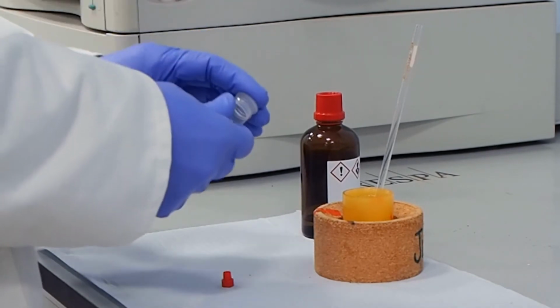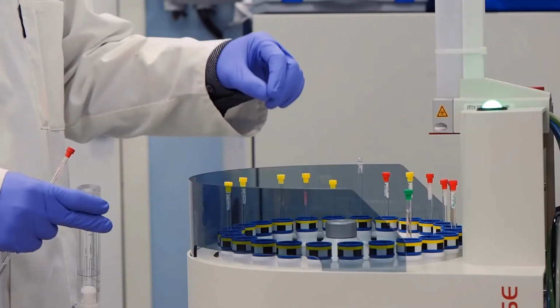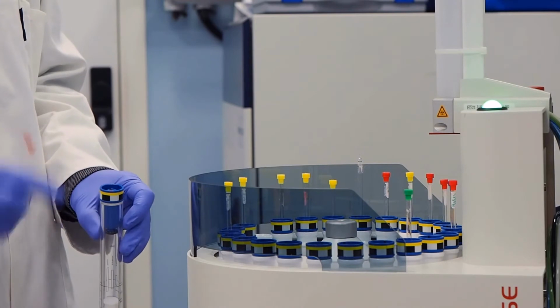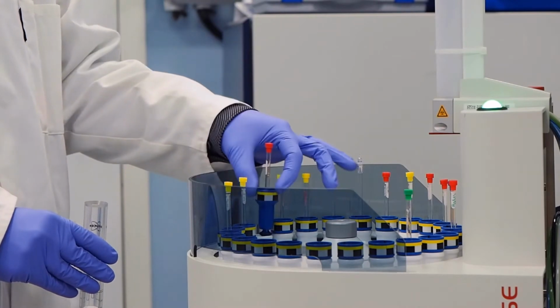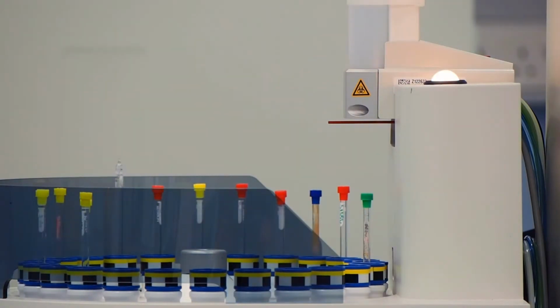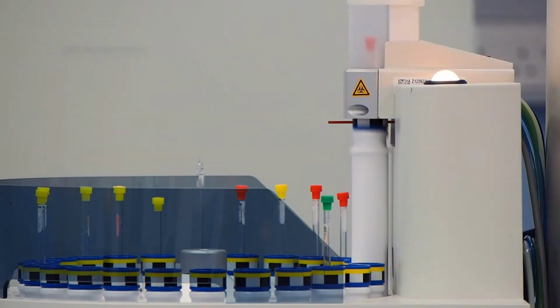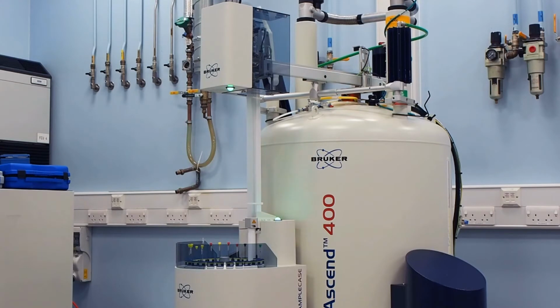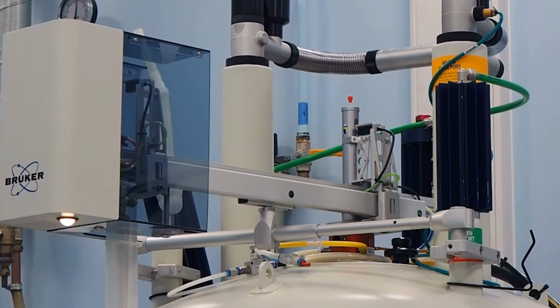That's how we make up, very simply, the NMR sample. We then cap it and take it across to the spectrometer. The first thing we need to do is make sure it's at the right height, such that it sits in the magnet properly. He then places it onto the carousel, goes over to the computer and selects his sample. The carousel goes around and uses some compressed air to pick up our sample and shoot it up, then a robotic arm passes it along and down into the core of the NMR machine. That's a very modern set of apparatus.